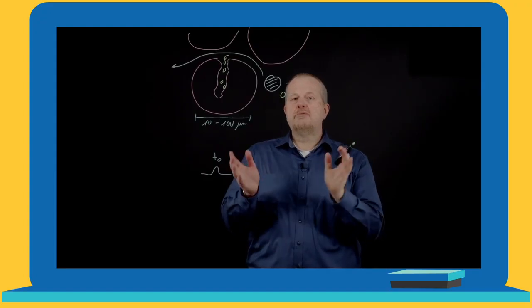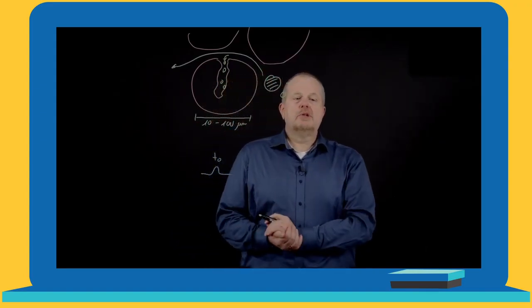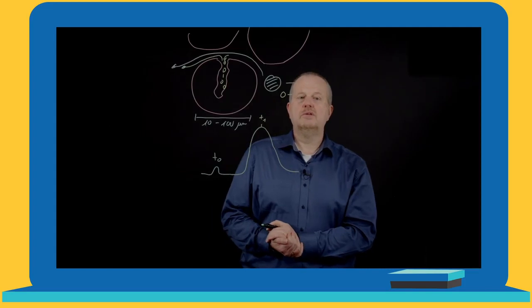And then we have the part which discriminates between the separation of different compounds. Here we have the adsorption of one of our compounds to the surface area. When we change the mobile phase, or after a certain amount of mobile phase has passed through the column, we have the desorption of our compound again, and it's transported by diffusion back to the outlet of the particle and is then transported out of the column. So at that point, we see this compound coming out and we can detect it. And we already know that this is the retention time of this compound, t1.